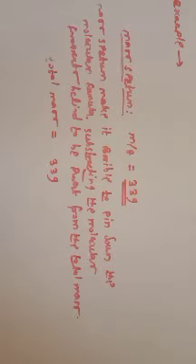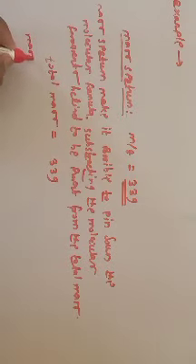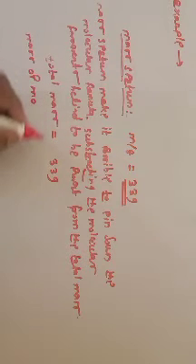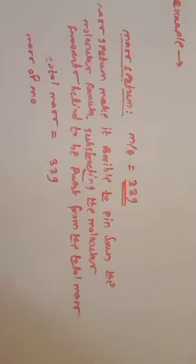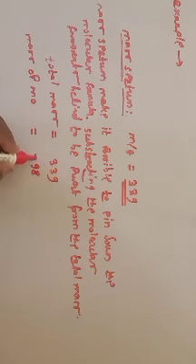If the metal atom is molybdenum, the mass of molybdenum is 98, so we subtract that from 339.